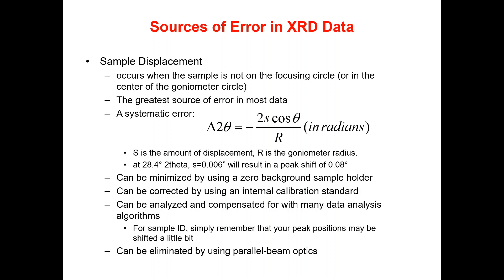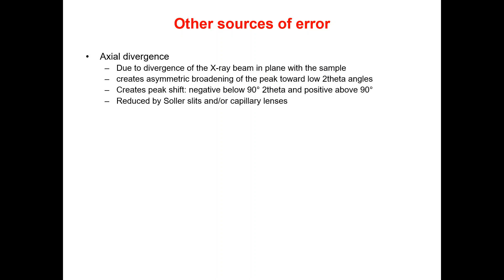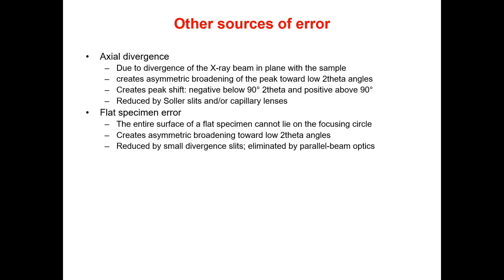Another source of error is axial divergence. Axial divergence occurs due to the divergence of the X-ray beam in the plane of the sample, which creates asymmetric broadening of the peak toward lower theta angles. It creates peak shift towards negative below 90° 2θ and positive above 90° 2θ. This type of error can be reduced by Soller slits or capillary lenses.